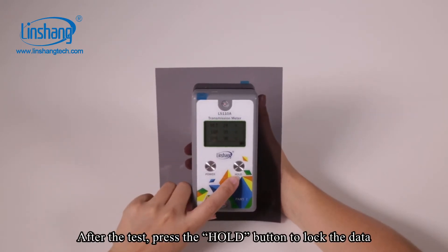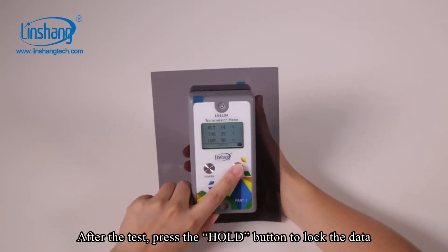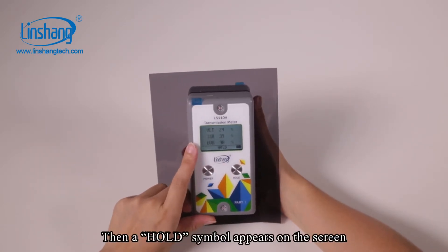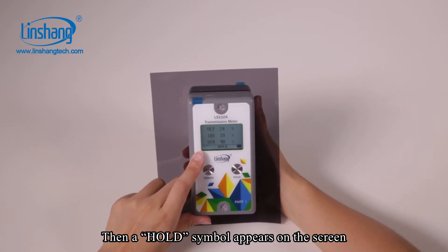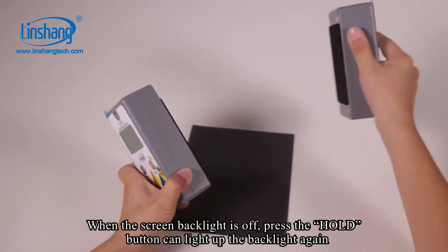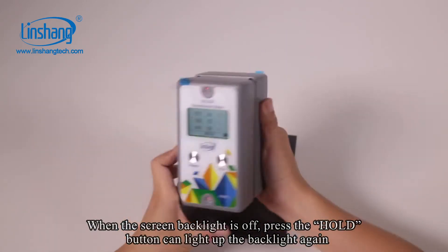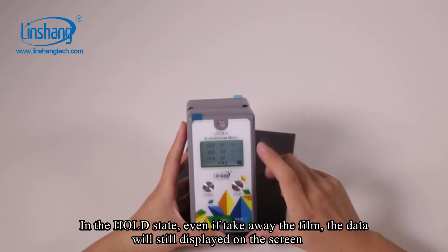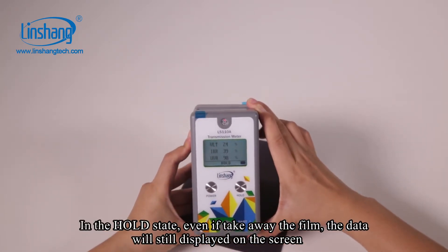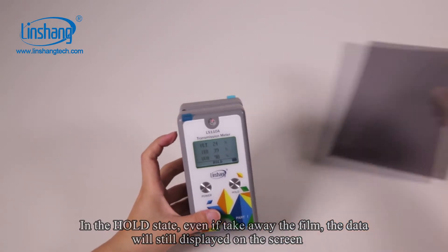After the test, press the hold button to lock the data. A hold symbol then appears on the screen. When the screen backlight is off, pressing the hold button can light up the backlight again. In the hold state, even if you take away the film or glass, the data will still be displayed on the screen.